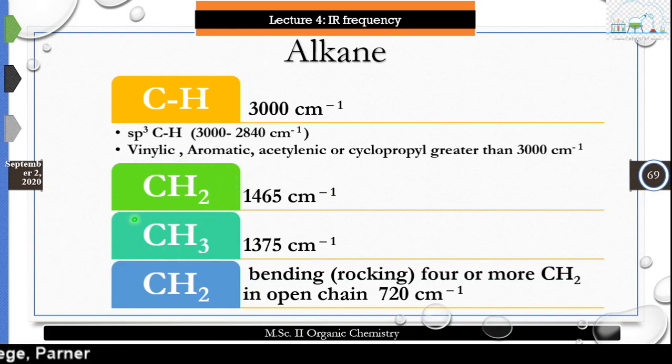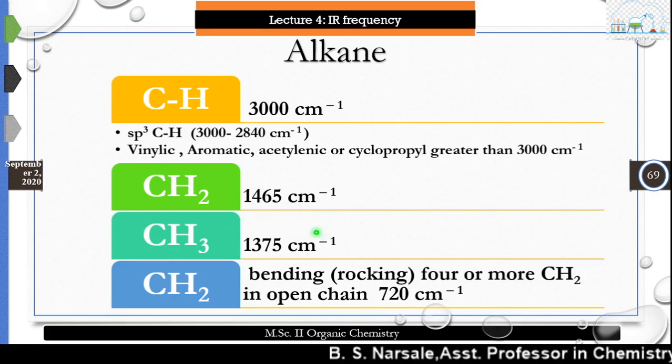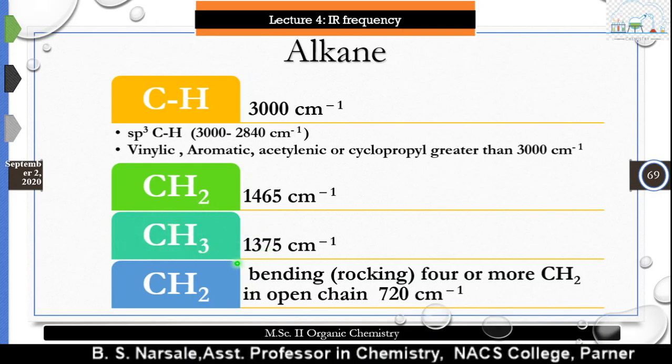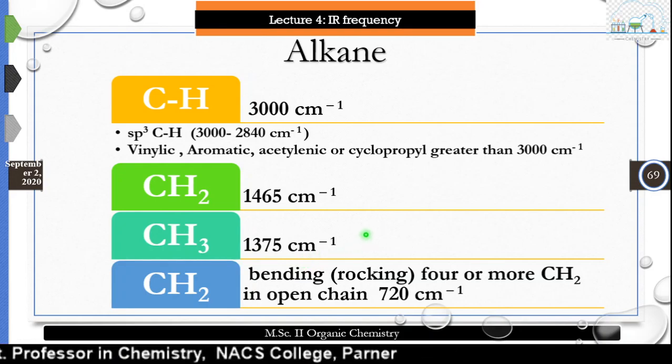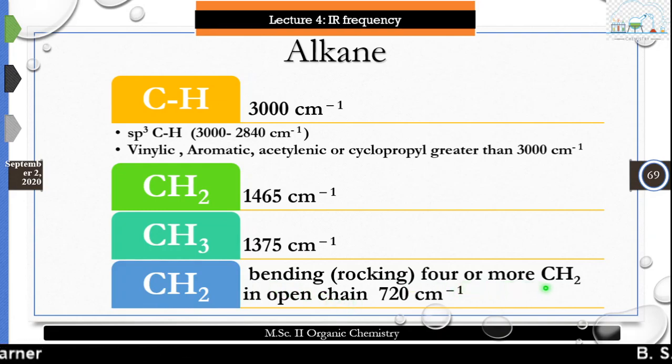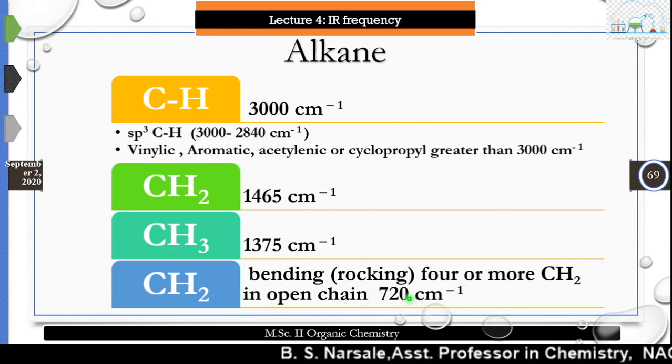The CH2 bending vibration will be observed at 1465 centimeter inverse, and for the methyl group, it is observed at 1375 centimeter inverse. When there is a long chain of CH2 groups, four or more carbon atoms, then the frequency 720 centimeter inverse will be observed.